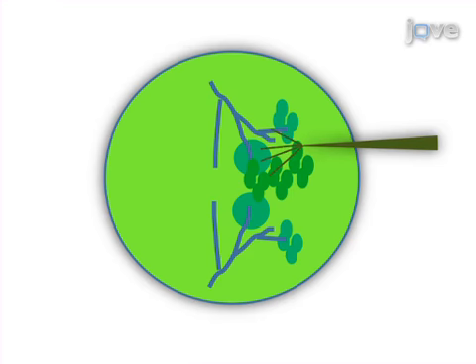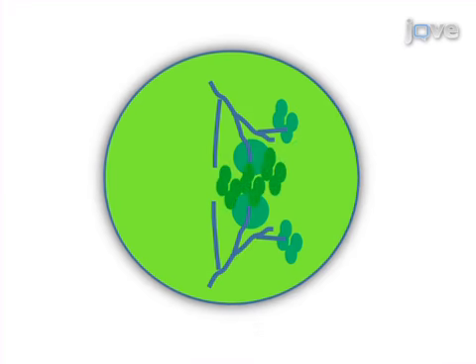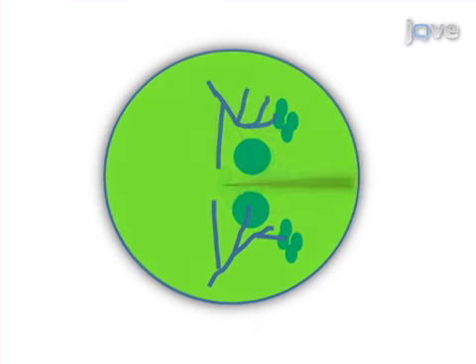GFP-tagged motoneurons in order to loosen the debris, glia, and trachea that obstruct the access to motoneuron 5. Next, debris, glia, and trachea are removed by gently sucking the loosened debris and glia into the pipette and pulling the trachea out of the way with the application of positive and negative pressure alternately.